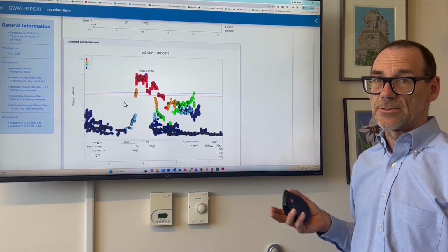In general, we'd want to look at the genes which are under the red SNPs, so in this case about 5 genes, which are under the most associated SNPs. That's probably the region that contains the causal variant. Thiago is now going to tell you a little bit more about these reports and how we get to the point that we can prepare one.